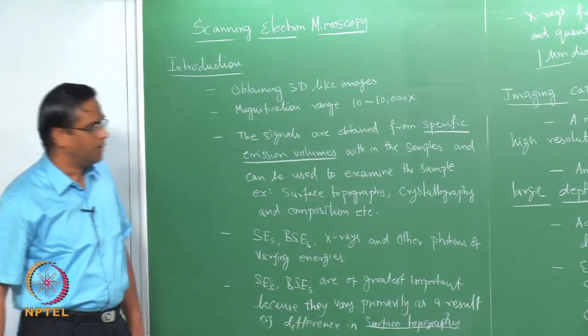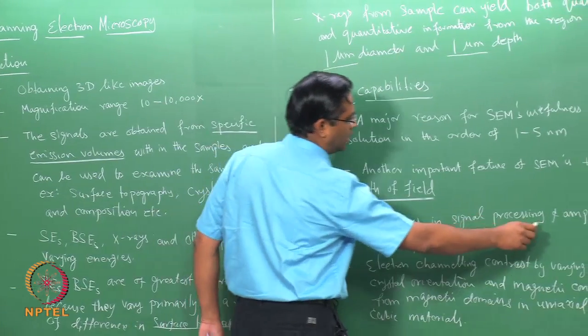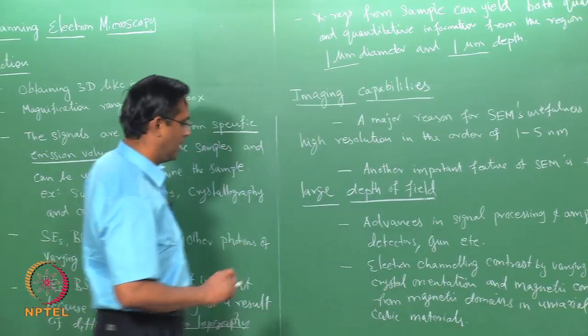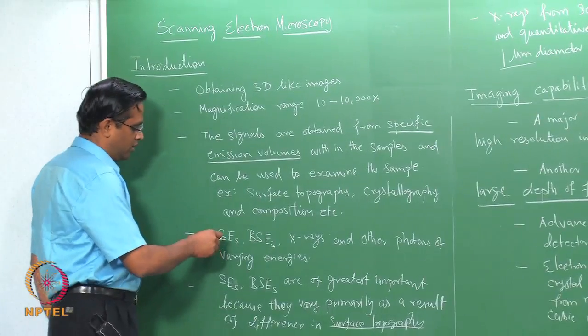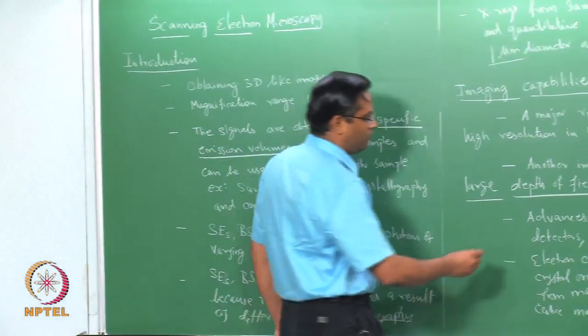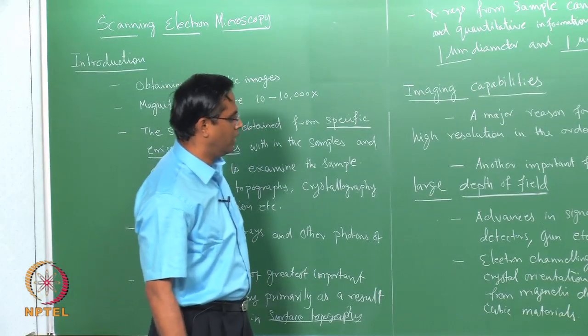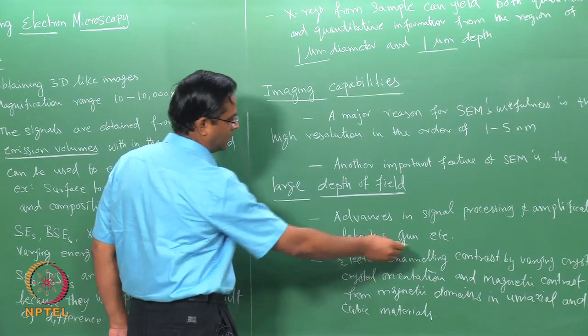And SEMs are becoming very popular because of the advances in signal processing and amplification, like the kind of signals you receive: secondary electrons, backscattered electrons or X-rays. And then you have advanced signal processing and amplification detectors, and gun design, etc.